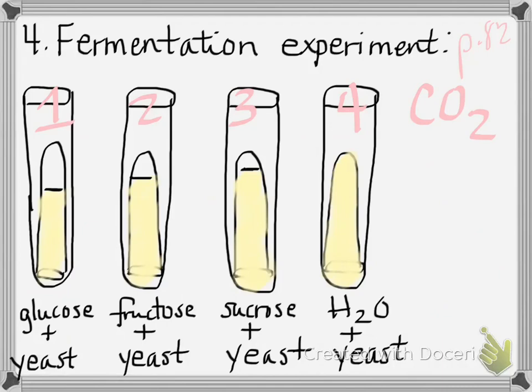Okay, and then how much carbon dioxide there is an indication of how well the yeast cells could ferment the sugar. Now, just check our class data. I usually like class data over individual data. On your class data, which sugar had the best fermentation? Glucose. And so I have that here too. See, my CO2 is right there, and I have the most CO2 on number 1. I think number 2 came in second place, number 3 got third place, and number 4 was dead last.